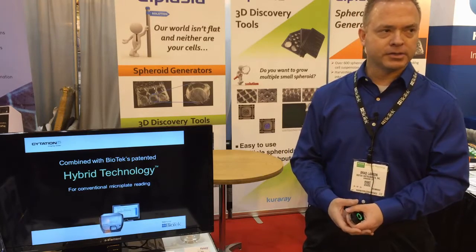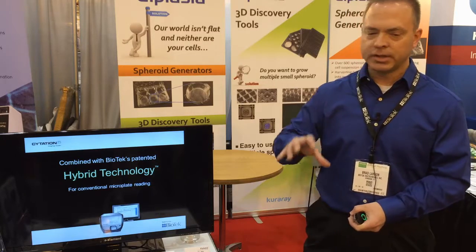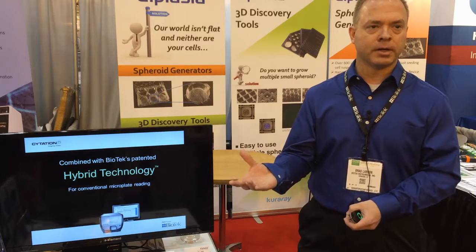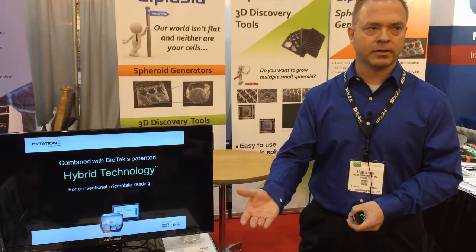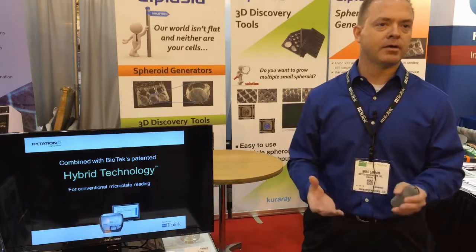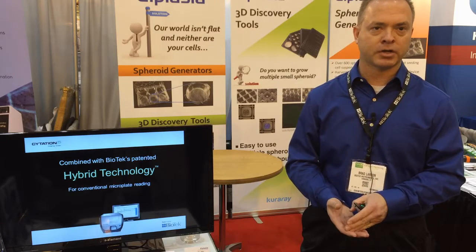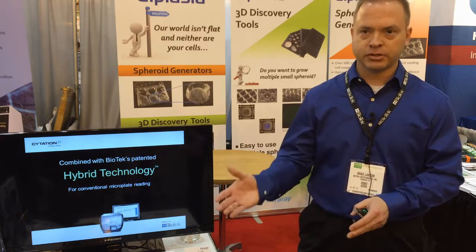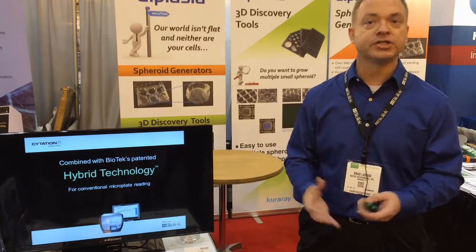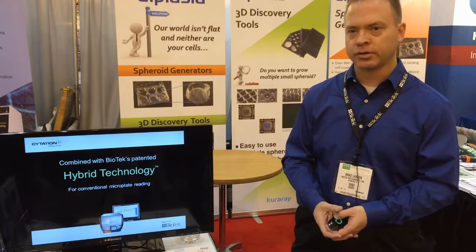It's a combination instrument with hybrid technology, meaning it's not only a cell imager but also a microplate reader. You can perform imaging with the inverted microscope, and you can also have a cell underneath the plate stage. You can have monochromator-based or filter-based microplate reading, and a laser can also be included, giving you a lot of flexibility for different types of detection.